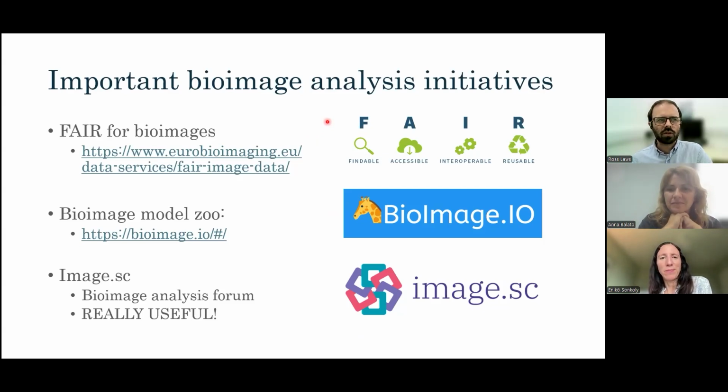Well, that's a really good question. So for cryo-EM, you would use that often if you're looking at, say, small particles. A lot of the time at the moment, people use it for reconstruction of proteins and things. So you're looking at stuff on the nanoscale, basically. And sometimes people use it for cryo tomography, where they've got a thin section of the tissue and they'll look at the thin section in a tilt series, I think, generally, to get a 3D image of that.